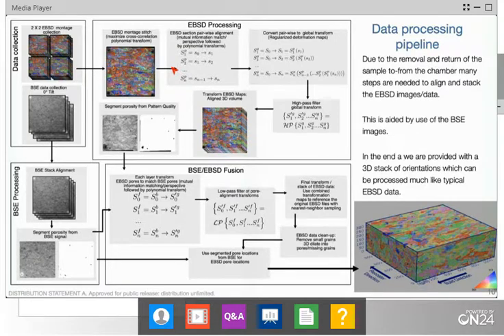One of the things that we found out, though, is that because of the directional nature of the additive manufactured microstructure, you can get a large grain that moves through your serial sections and can drag certain corners along with it. And so that required some further filtering of these displacement fields. What we did is we basically said, okay, eliminate any low frequency noise. We only want the high frequency displacements moving from section to section. That gave us a very good alignment of that data.